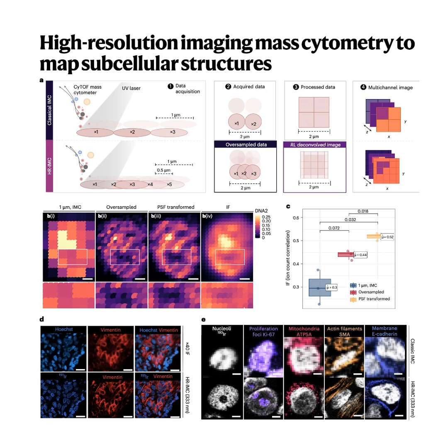It accounts for the fact that a subpixel hit 3 times will have X amount of signal left, while one hit only once will have Y. And that decay isn't a straight line. So this model lets the computer know exactly how much signal to expect from any partially ablated area. That's the one. It's a huge computational leap. They modeled the physical destruction.